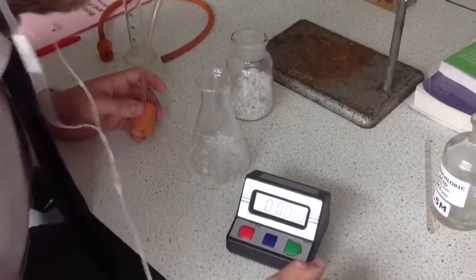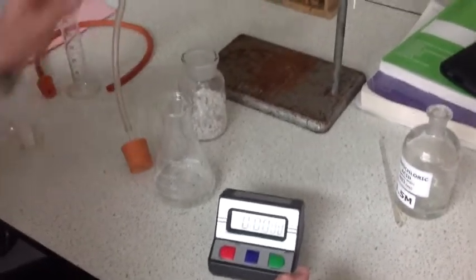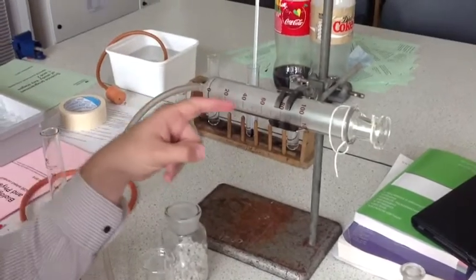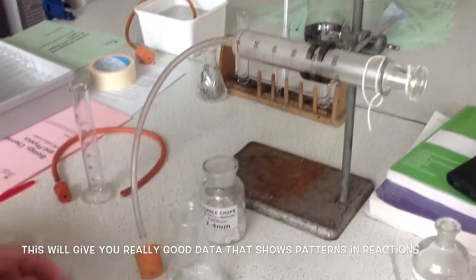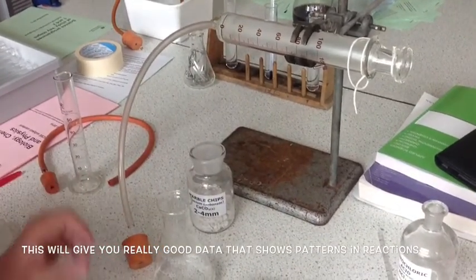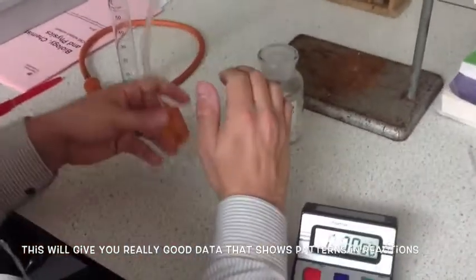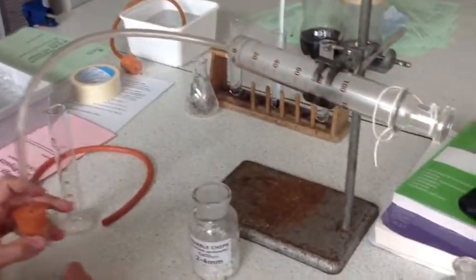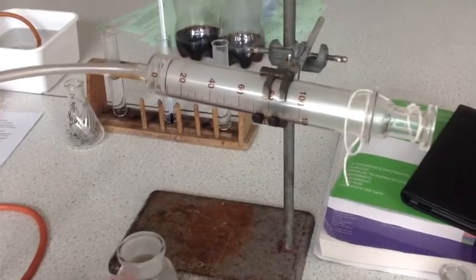This method of recording data from the same experiment is slightly more sophisticated. This piece of equipment here is called the gas syringe, and it allows you to actually measure the volume of the gas that's being produced. So rather than just saying the amount of time it takes to produce a gas, you can now say how quickly that gas is being made. So if I add some more calcium carbonate, some marble chips to my acid, add in the bung and start the timer, I can actually measure after a certain period of time how much gas is being produced.